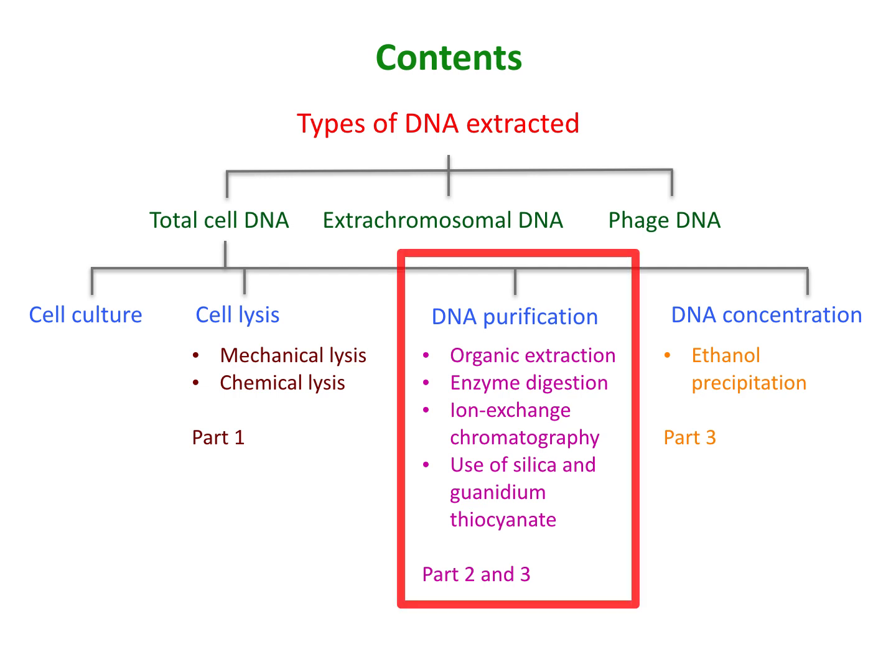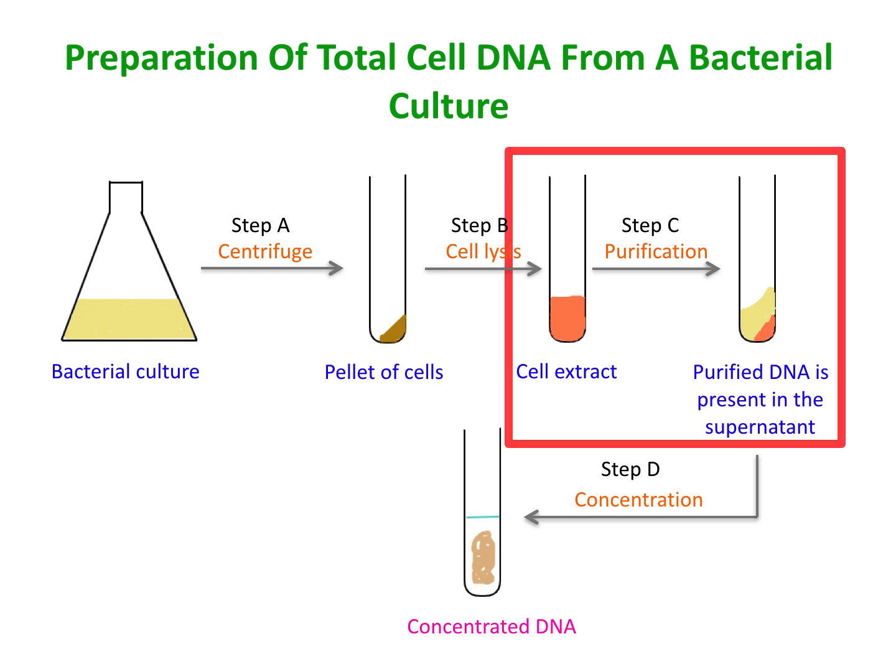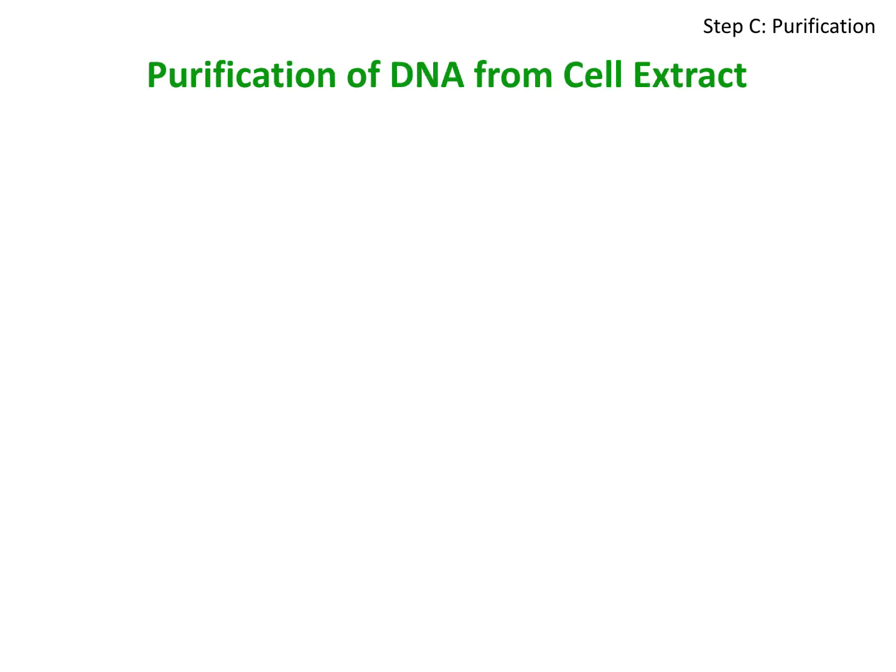In part 2, I am going to explain the methods of DNA purification. We have seen in part 1 that the cell extract contains DNA, RNA, proteins and several other biochemicals. In step C, the contaminants are removed so that pure DNA solution remains in the extract. While purifying DNA, certain reagents are added to the cell extract to degrade the contaminants.